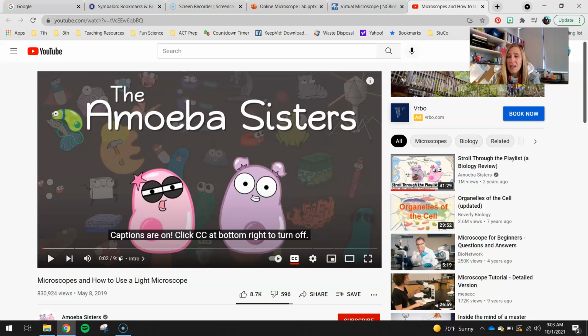You are going to learn a little bit about the difference between that and a transmission electron microscope, which is also a really fancy piece of equipment, but you see more of the inside of a bacteria or something really small, and even viruses. And what we use in class, just to see basic cells, is a light microscope. You will learn how to use a light microscope through this video, and then also with the virtual link.